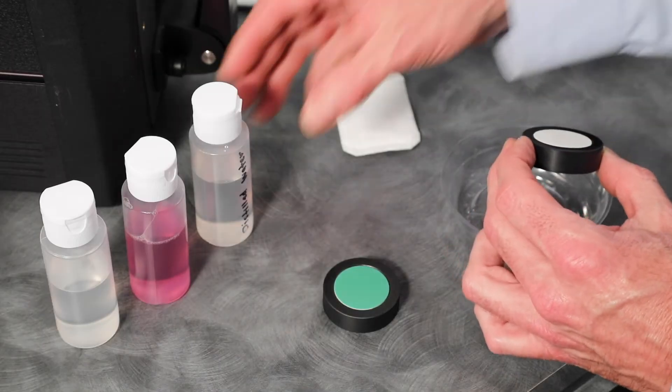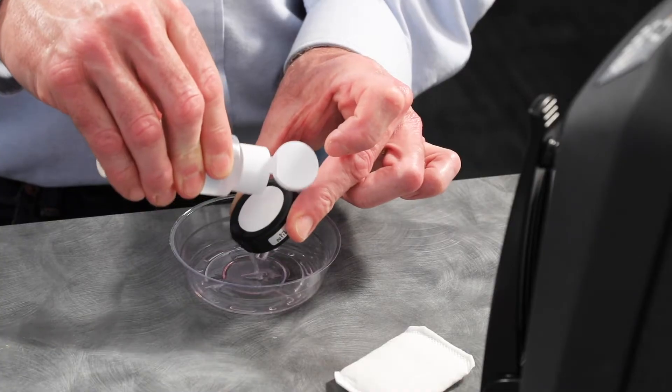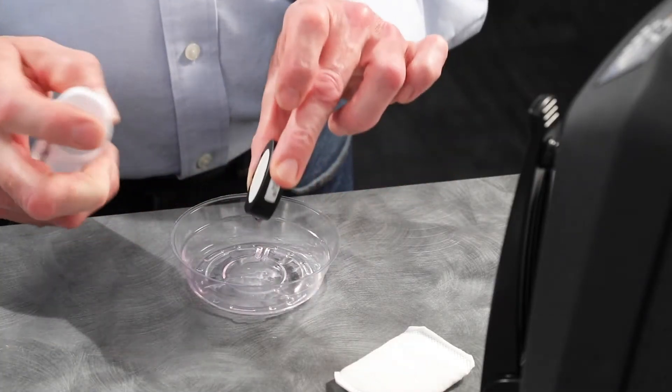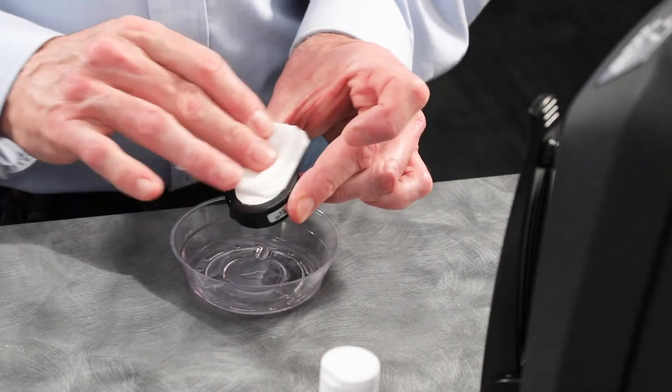Finally, use the distilled water to rinse off the remaining glass cleaner before it dries. Dry the surface completely using one last wipe.